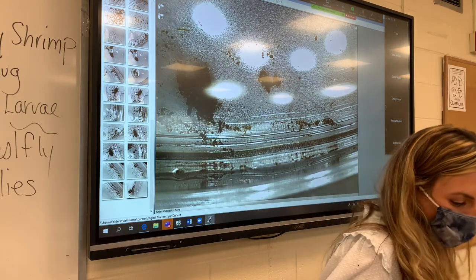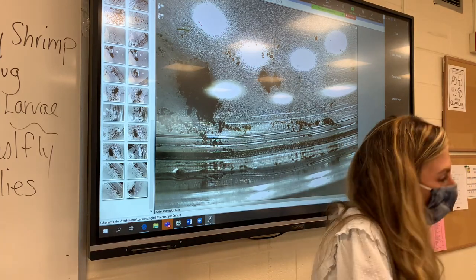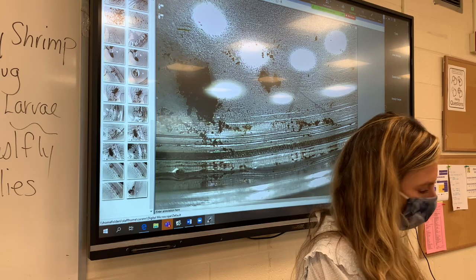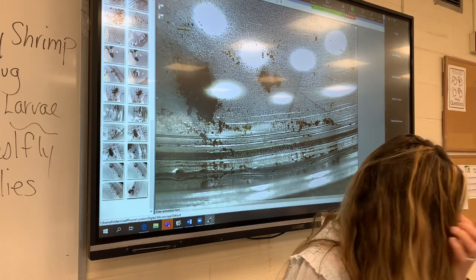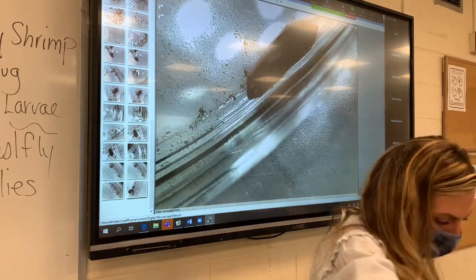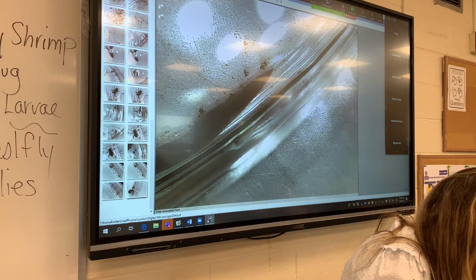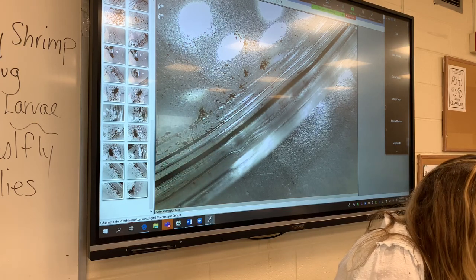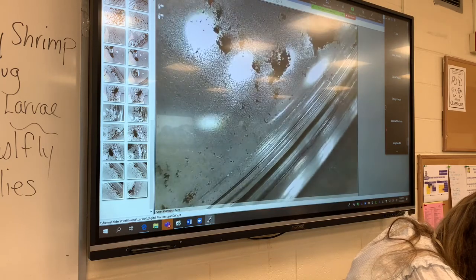We've never done this before — this is the first year we're even attempting this. I'm super excited, I hope you're excited too. Today's date is 10-6, and this is period three. We're going to put our victim in — this guy looks acceptable, right? We should name him... Clifford, like the big red dog, but I have a student named Clifford.